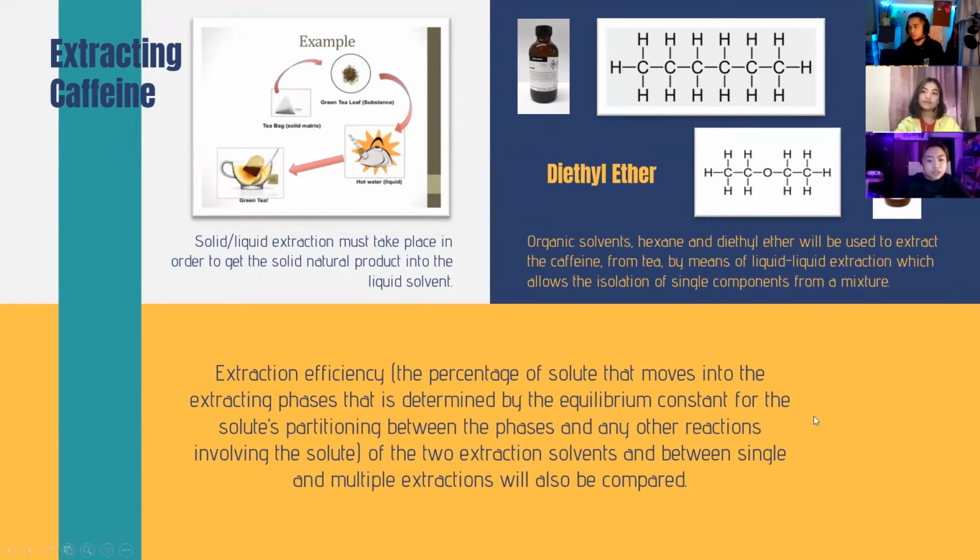Alongside this, the extraction efficiency, which is the percentage of solute that moves into the extracting phase, is determined by the equilibrium constant for the solute partitioning between the phases and any other reactions involving the solute. The efficiency of those two extraction solvents and between single and multiple extractions will also be compared.